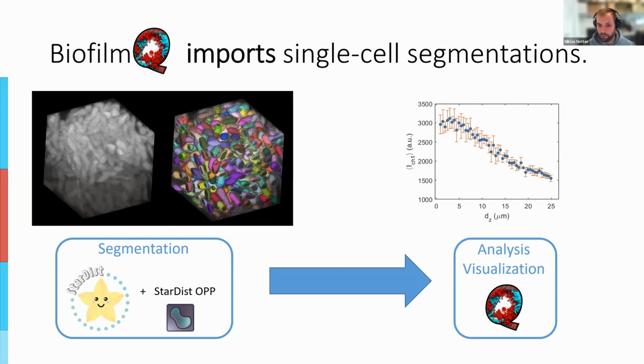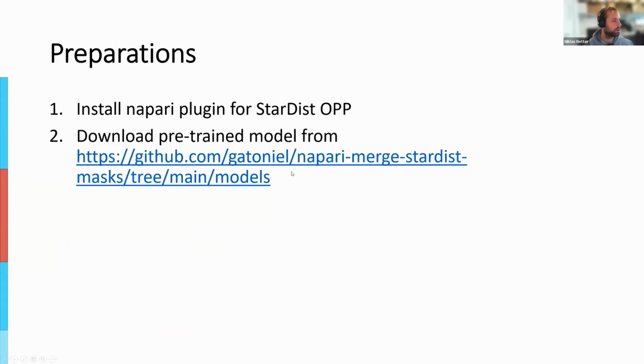Are there any questions so far? Otherwise, I will now start with the more hands-on part. For the hands-on part, I hope people prepared themselves maybe. We have to install the Napari plugin for StarDist OPP, and we need to download a pre-trained model.